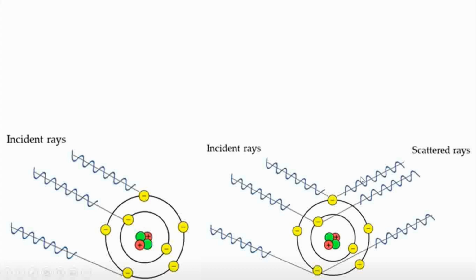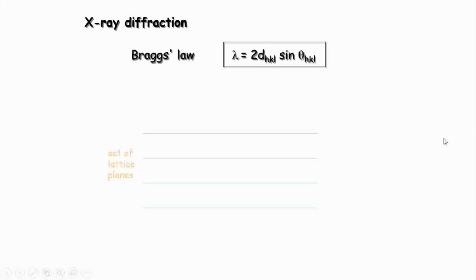And this change in wavelength and how they interact with each other will give you the information hidden of the structural orientations, hidden by the pattern of how these wavelengths are emitted out from the atom, right? So if you see, this is the X-ray falling, and this is the angle.